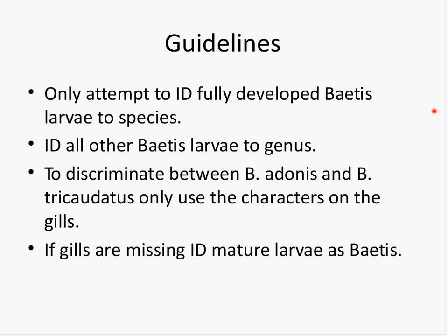Everybody on this call now, basically, who's done the Southern California work has had about 119 Baetis or some 300 Baetis that they have to go through and look at for these spines. And I know that both have taken the work here in the lab or the external QC work that I do and slide mounted every single one of those. So it only requires a lot of work, but we think if we create a specimen pool here, it'll get good specimens for whoever's going to work on this.